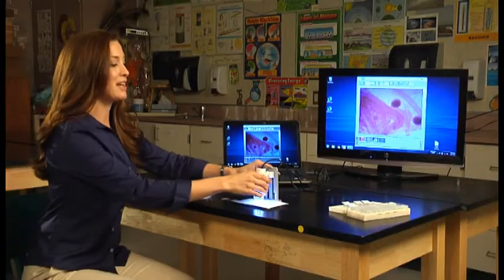The SmartScope 500 can also do things that you cannot do with a traditional microscope. Since it's handheld, you can use it to view anything you want to get a closer look at.